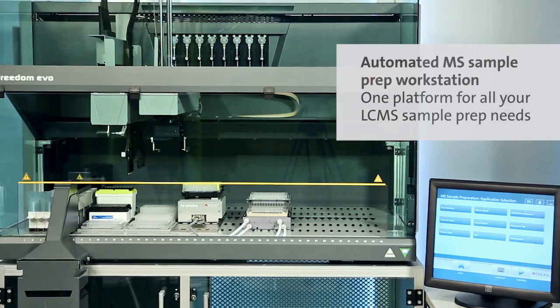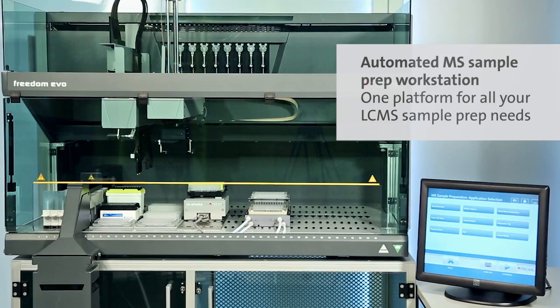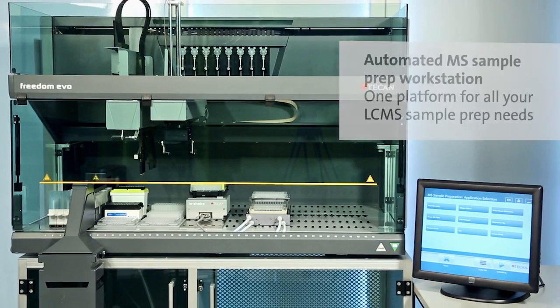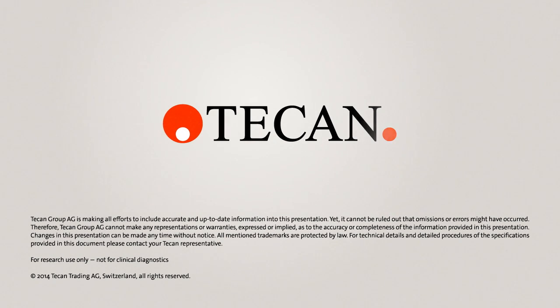TCAN's MS sample prep workstation: the one-stop solution for all your LC-MS sample prep needs. Find out more on TCAN.com/LC-MS or contact your local TCAN sales representative.